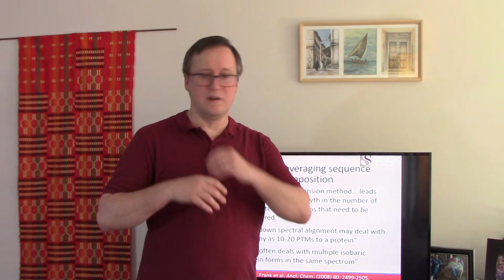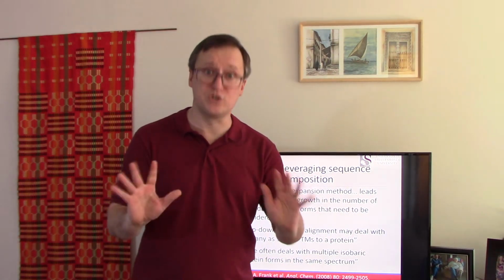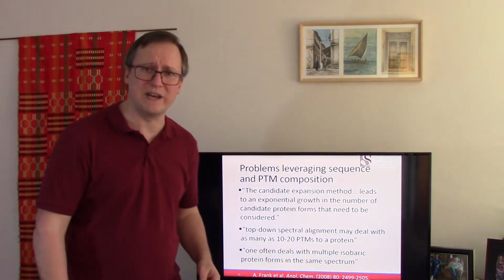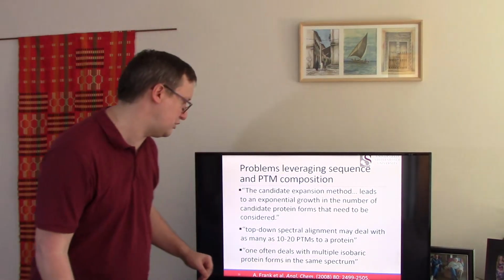If you have 50 modifiable sites and 20 PTMs you need to distribute across them, you have a huge number of possible localizations that you need to take into account. Doing this by just expanding it out is not very viable.